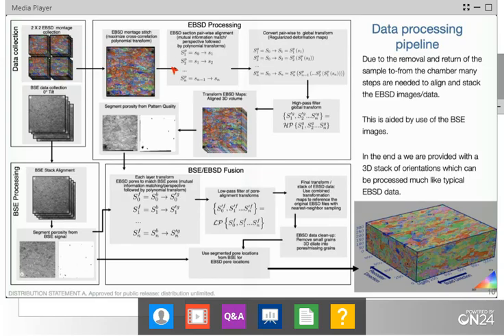And then we did pairwise matching of all of the sections. So basically we matched section 0 to section 1. And then we match section 1, but not the new version of 1, it's still the old version of 1, to 2, old version of 2 to 3, et cetera. That gives us how we need to move from each step to each step. We then regularize that into certain displacement maps. Those displacement maps tell us exactly how each pixel needs to move.